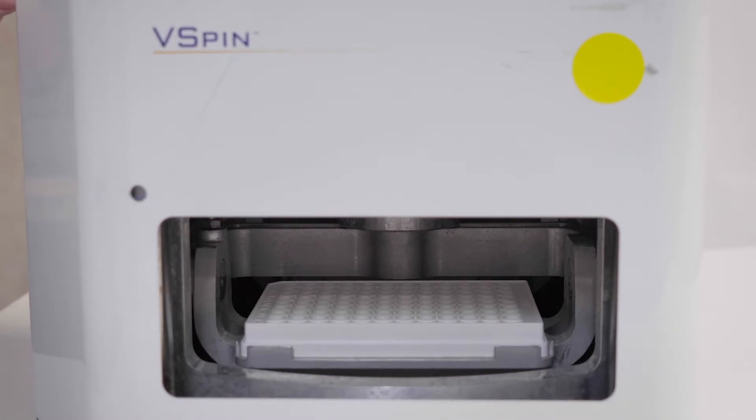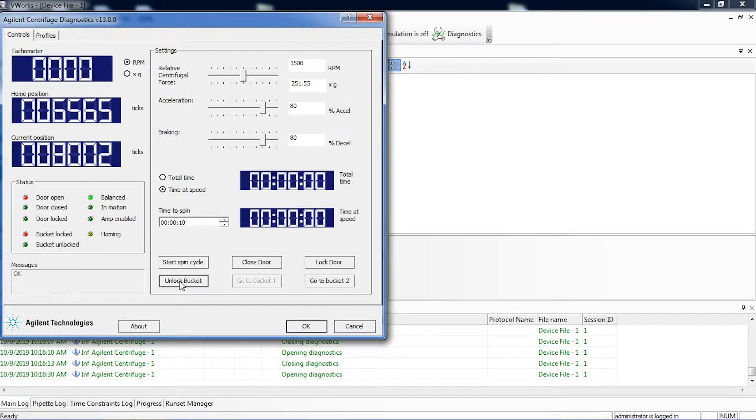You can relock the bucket and see how the alignment is on the shoulder based on the bucket lock. If you need to, unlock the bucket and make any minor changes you may need until your bucket is aligned.